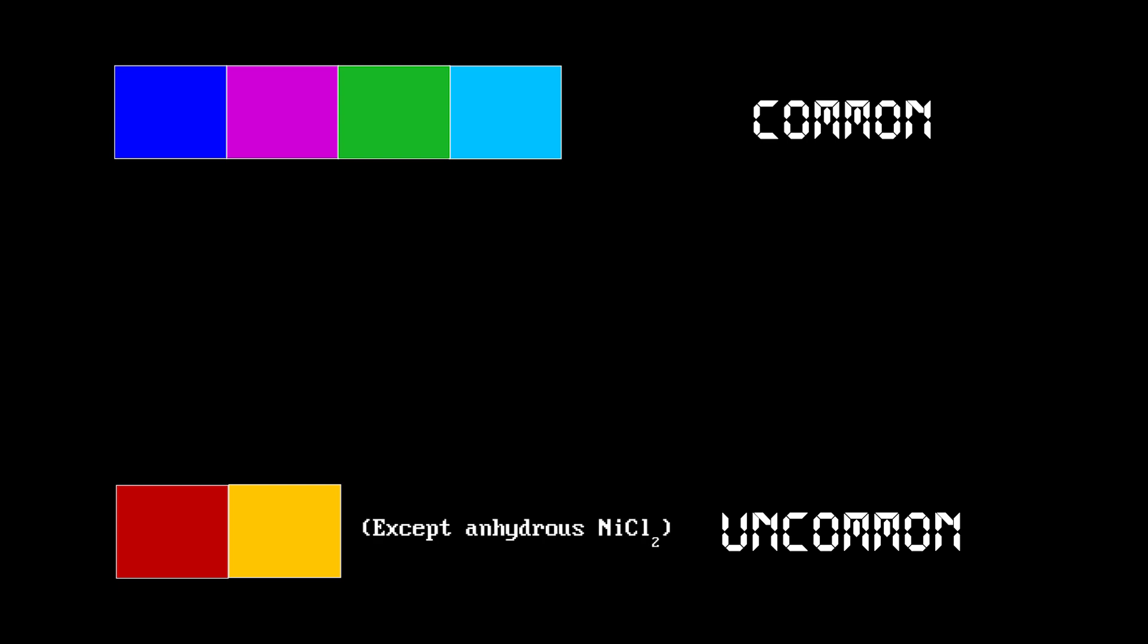Rarer instances of nickel compounds have a vibrant red color, one such example being nickel's complex with dimethylglyoxine. Only very rarely do you come across nickel compounds with a yellow or orange color. Now, for the synthesis.